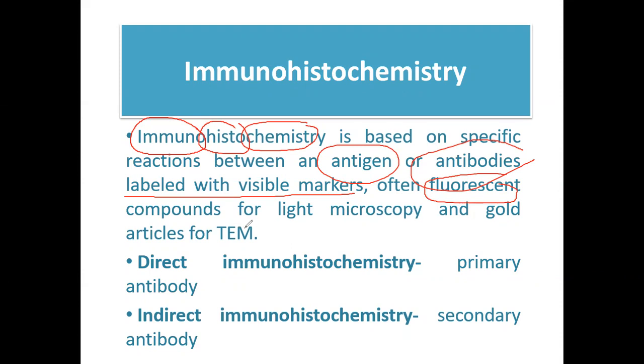We may use proteins. We can also use, for example, biotin-avidin to label, or enzymes, depende. And of course, the reading of the result now depends on the label that you use.